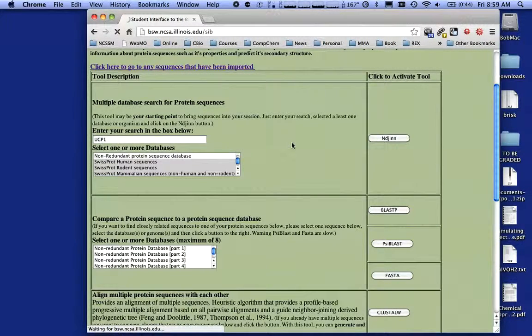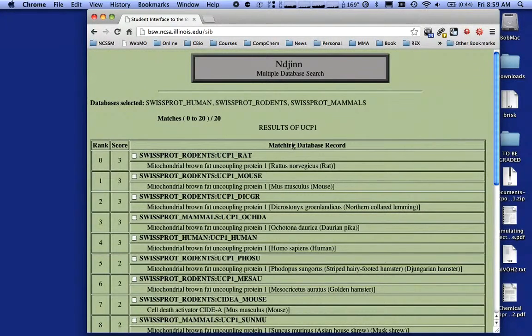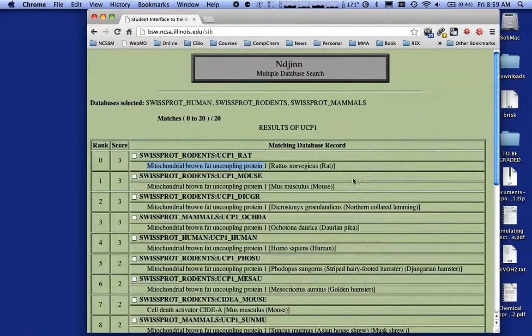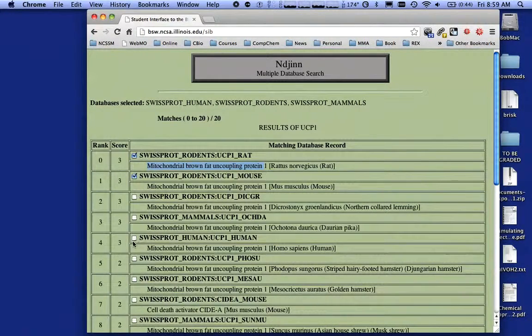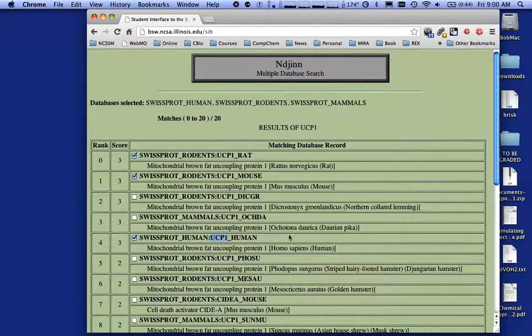This will take a few minutes. It looks like I've got 20 hits. UCP1 is the mitochondrial brown fat uncoupling protein. The first hit is UCP1 for the rat — I want that one. There's one for the mouse — I want that. I don't want the lemming. I do want the one for Homo sapiens. When importing sequences, be careful to confirm they all have the same prefix — UCP1 — for the ones you're selecting.